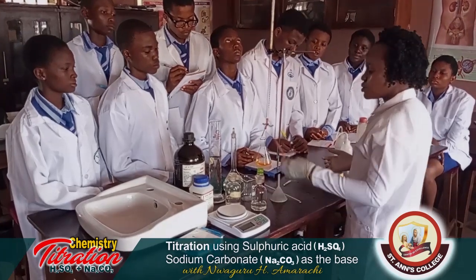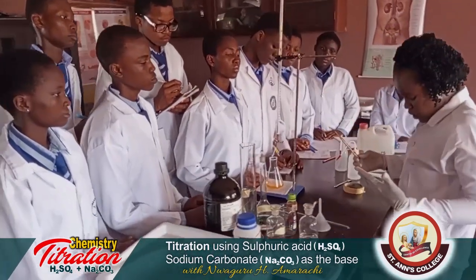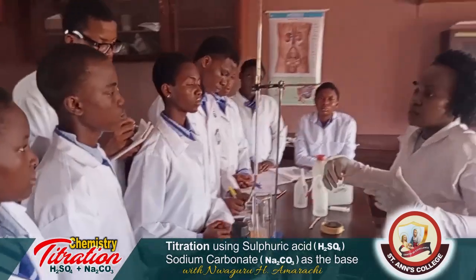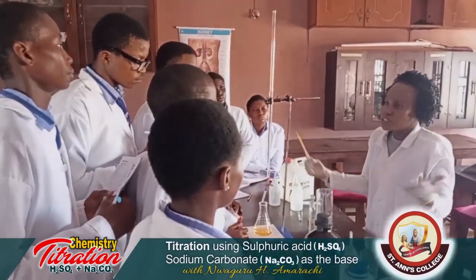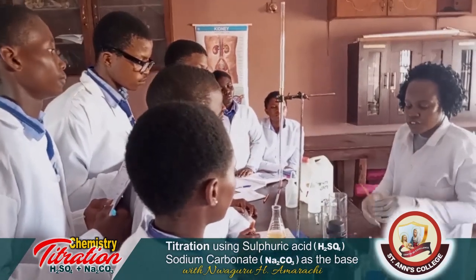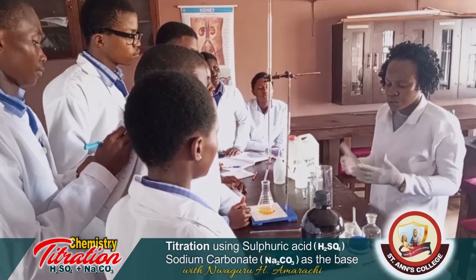Mind you, this material is orange, it has a color. In case you're not wearing a lab coat, something may happen that it will touch your body, your clothes, sorry, and it will stain your clothes. But if it stains your lab coat, you can easily pull it off and wash it, not your clothes.